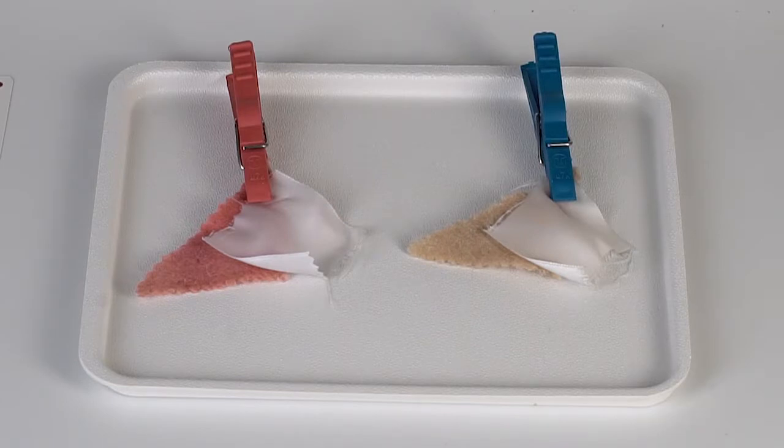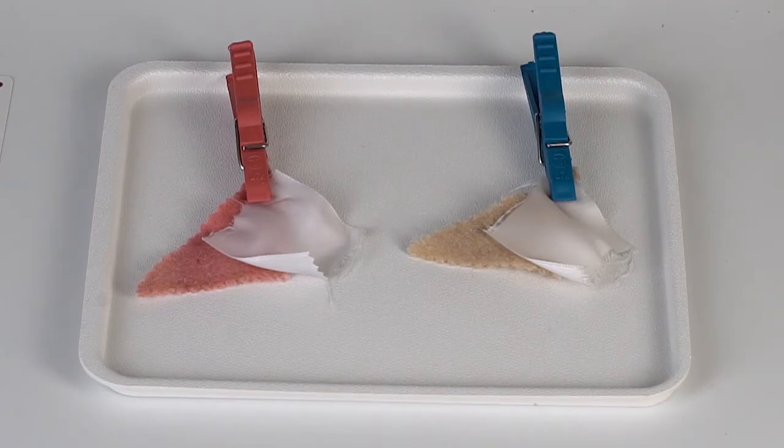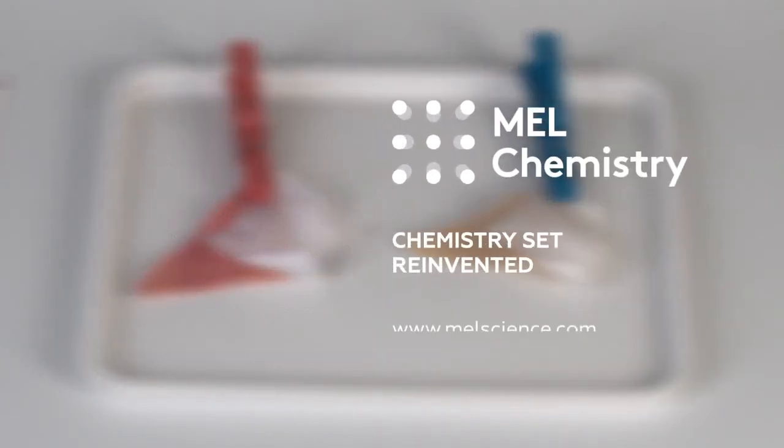This is why eosin colors the wool, but carmine is washed off of both fabrics. Learn more about this experiment on our MEL Chemistry website.